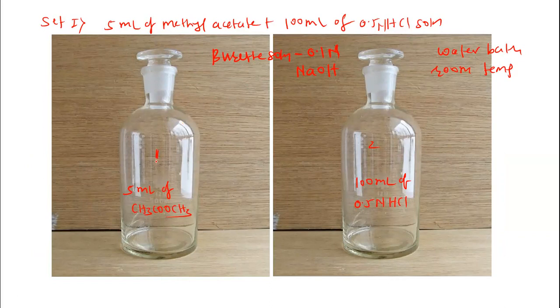we have to mix bottle number 2 into bottle number 1. The 100 ml HCl should be transferred into bottle number 1. Bottle number 1 already contains 5 ml of methyl acetate, and we are now adding 100 cm cube of 0.5 normal HCl. We have to mix the solution and note the mixing time.